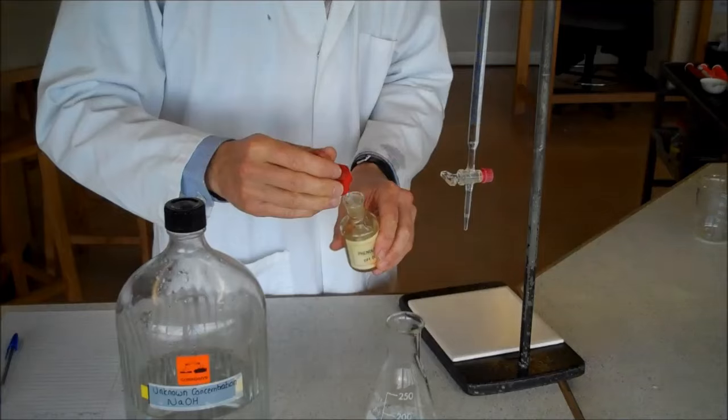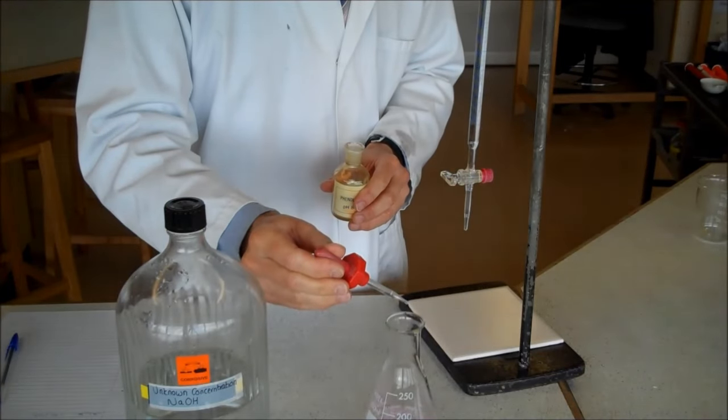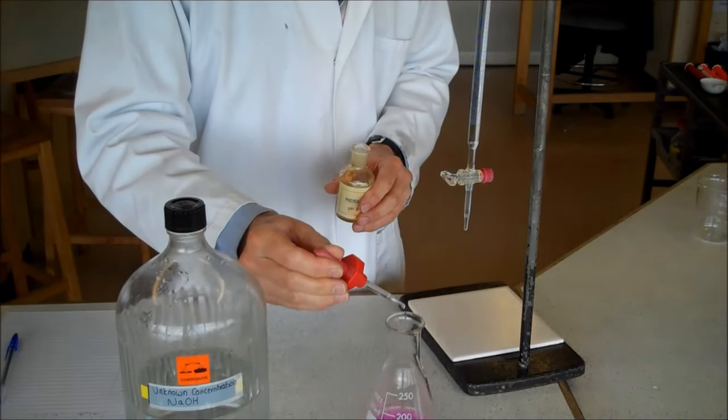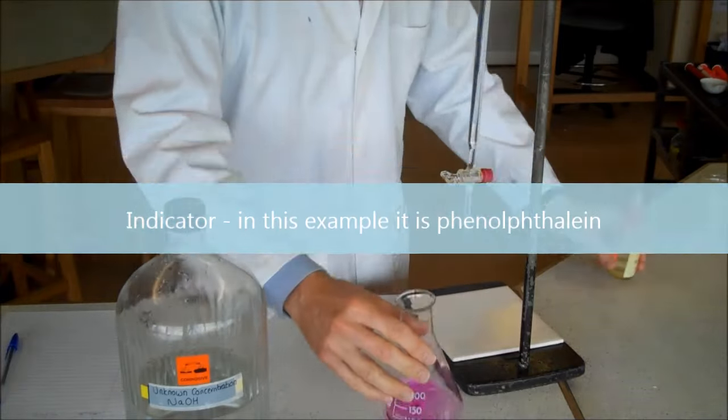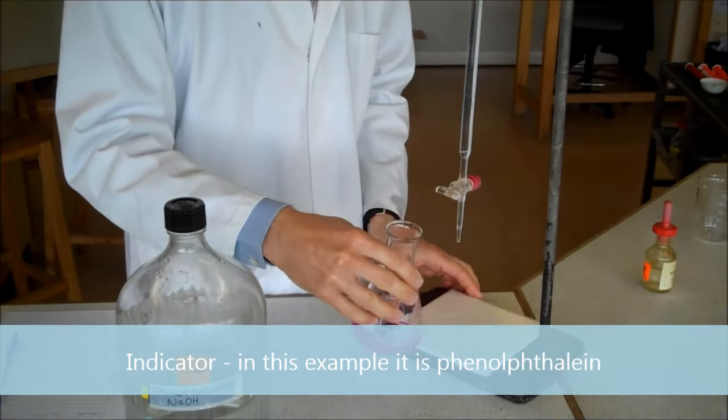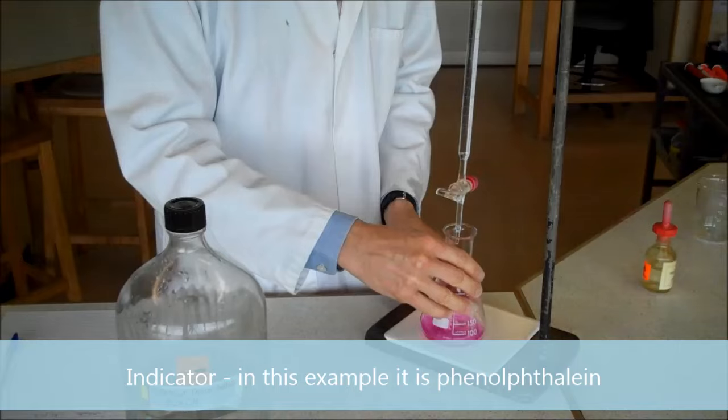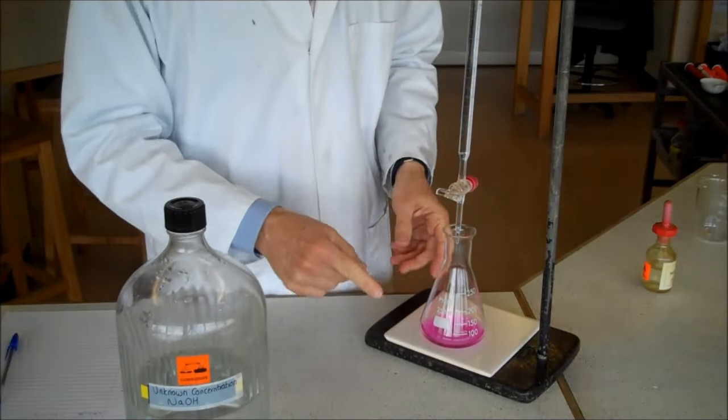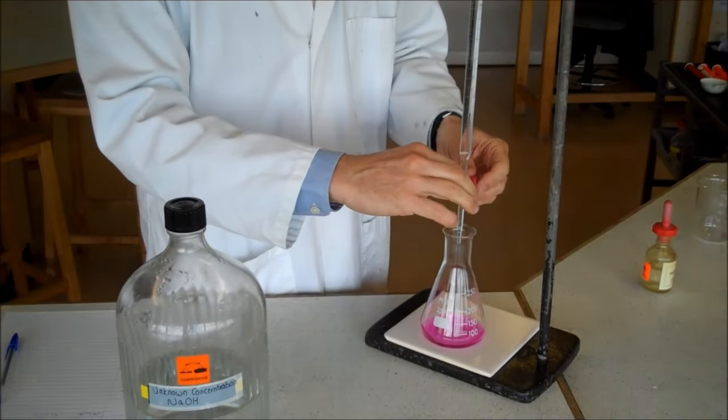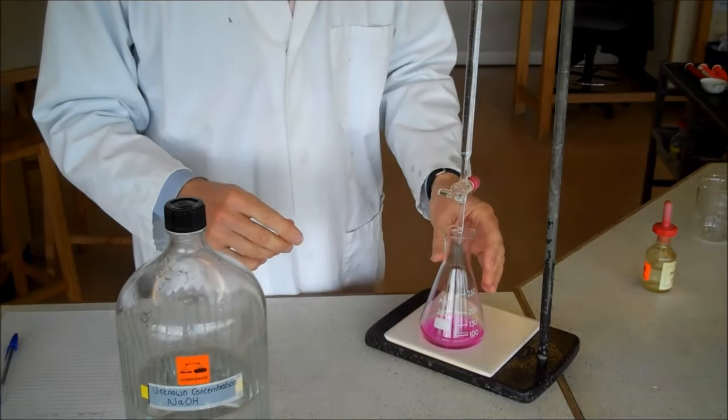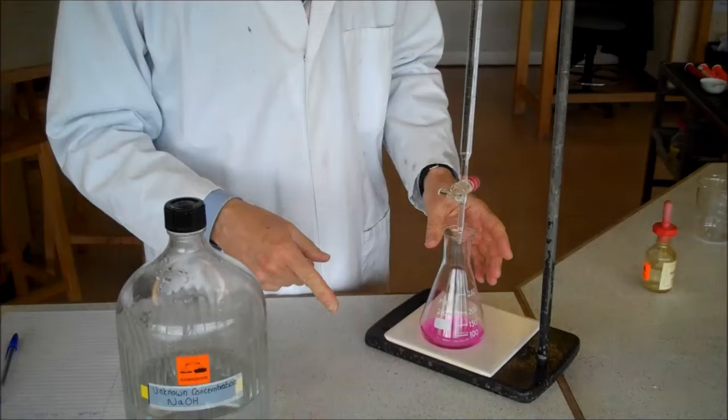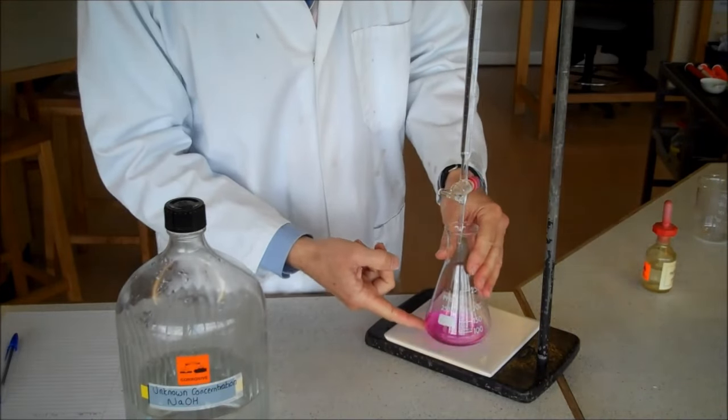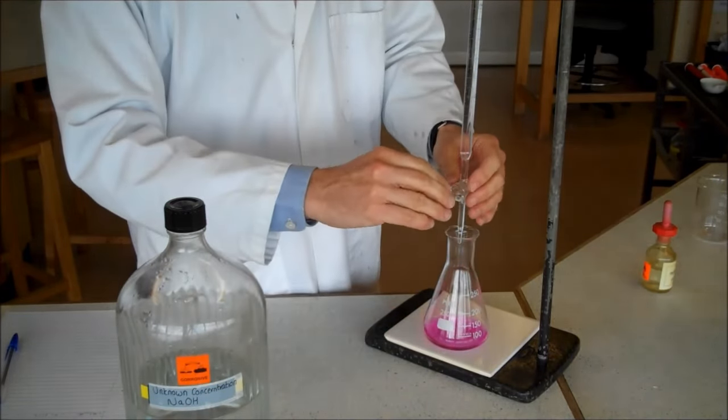We add a few drops of indicator. One, two, three, four, five. Near enough. That is phenolphthalein. It's very good. It gives a nice, clear color. Bright pink when it's alkali and colorless when it is acid. Colorless, not clear. A lot of people say clear, but it's already clear. It's a clear pink liquid and it goes to colorless in acid.